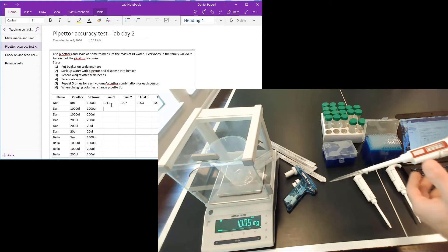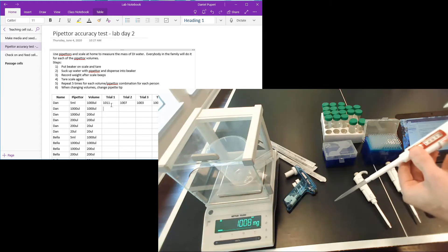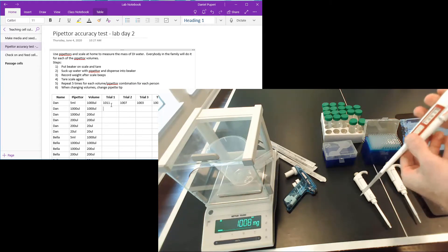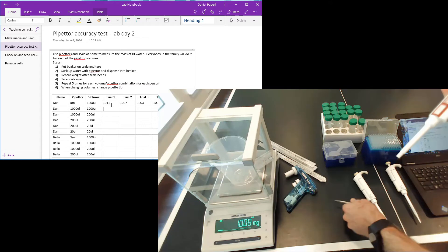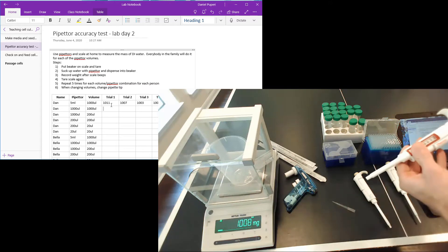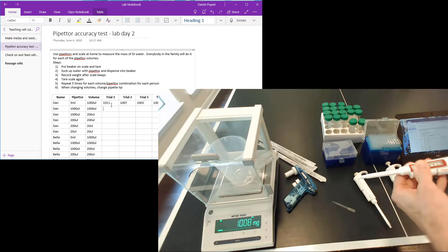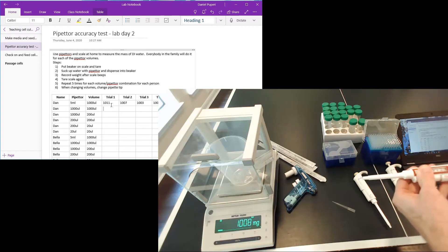So I've done all my measurements with this. Now I'm going to remove the pipette tip and go down to 200 microliters to keep proceeding on this experiment.